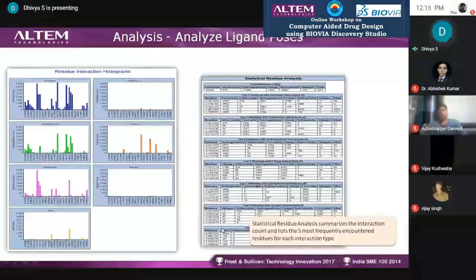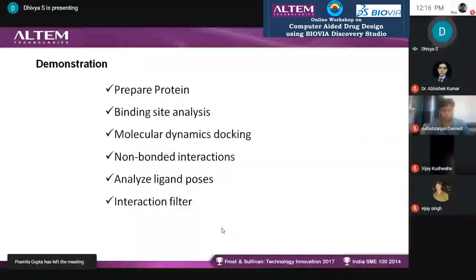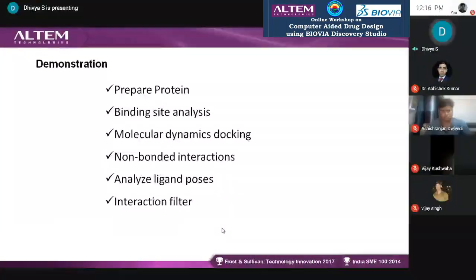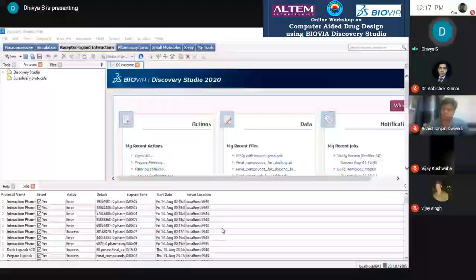I am going to show all this today in the demonstration. We will cover protein preparation, binding site analysis, docking with CDocker, and interaction analysis. Today I will illustrate using the example of 6M0J, which is the spike glycoprotein receptor-binding domain of SARS-CoV-2.